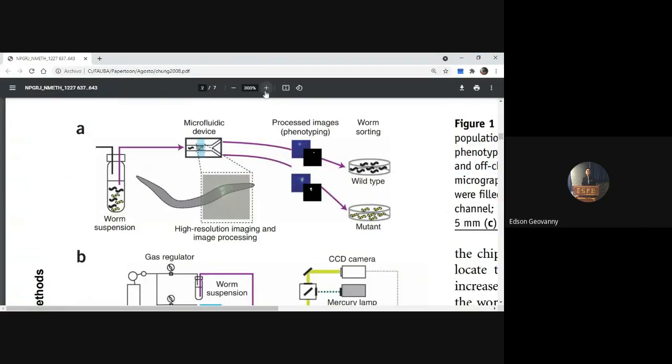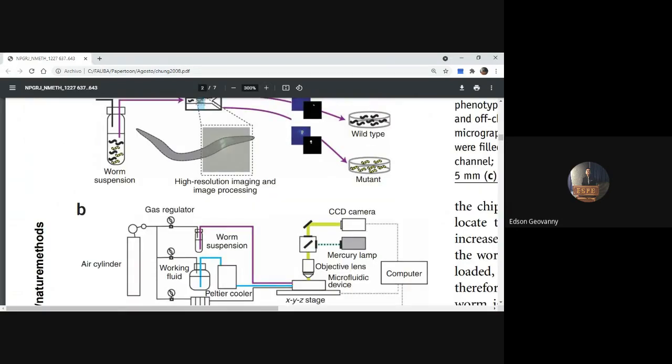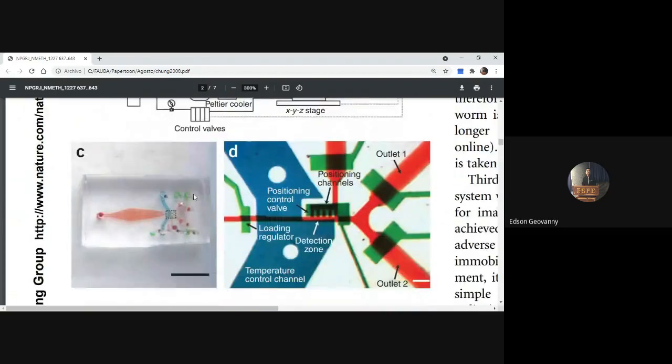In this part, they present an integrated microsystem to perform high-throughput microscopy for phenotype-based classification. The chip uses valves to control the suspension of nematodes and presents several characteristics that allow the operation. A system was designed to control the entire process of analysis and classification of worms based on many characteristics. Software automation enables the chip to highlight six features to ensure consistent and reliable operation.